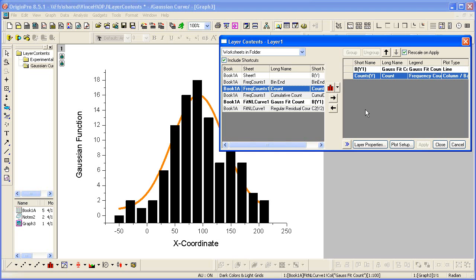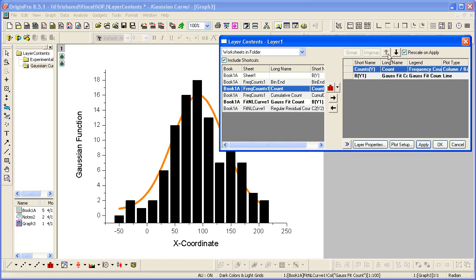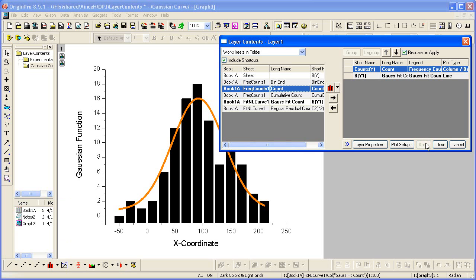Notice that the data has been added, but unfortunately, my reference curve is now behind the data because by default, the new dataset comes in with the drawing order on top. This is easy to fix. The up and down arrows on the right part of the panel can be used to swap the drawing order of the data. Clicking Apply brings my reference curve now to the top.